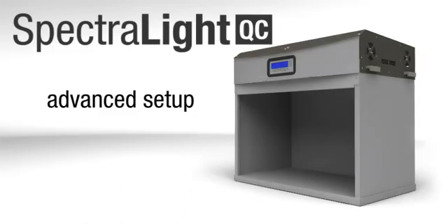Advanced Setup offers many options for configuring the Spectralite QC to fit into your specific workflow. There are many system configuration options available. Here's how to access them.